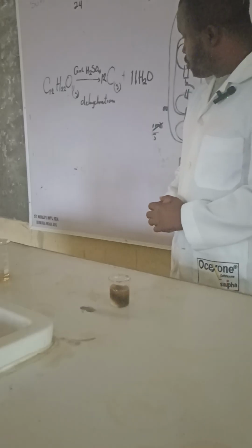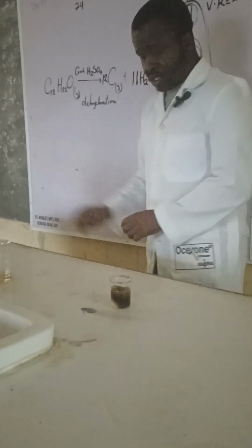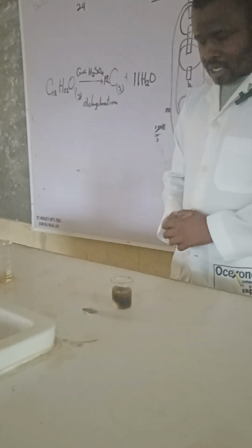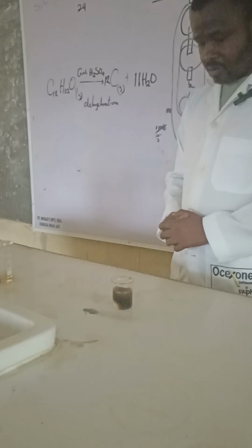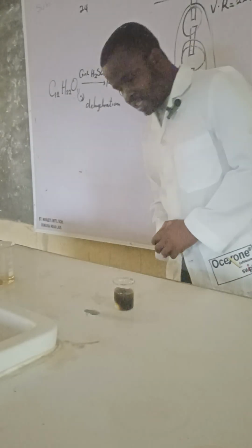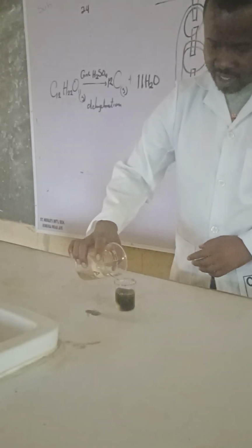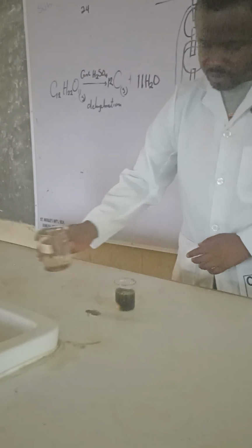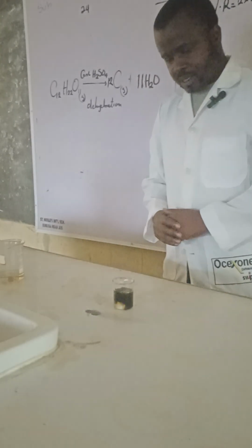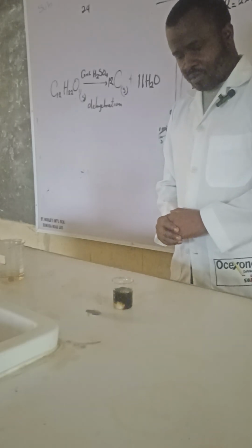to produce sugar charcoal. So it was actually sucrose, which is cane sugar. The dehydration process occurs gradually. It's a very gradual process, but later the reaction gets very exothermic. The reaction will get exothermic with time. So it's a slow reaction at first. It feels hot to touch. So it's an exothermic process.